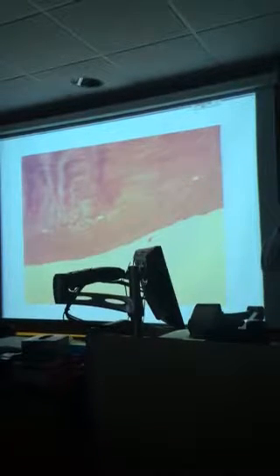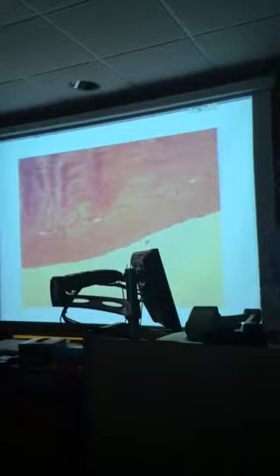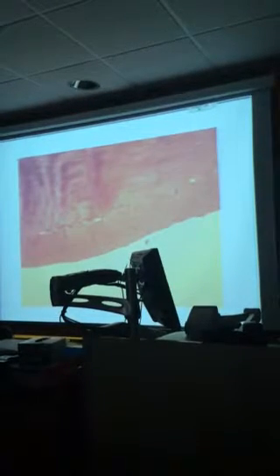Now, the outer layer here, again, is serosa. You see it sort of peeling away here. Simple squamous over loose connective tissue. But much of the duodenum is retroperitoneal, which means this is not synonymous with visceral peritoneum. It's just simply the serosa. So if I ask retroperitoneal organs in the GI tract: much of the duodenum, ascending and descending colon are also retroperitoneal. The other parts are within the peritoneum.